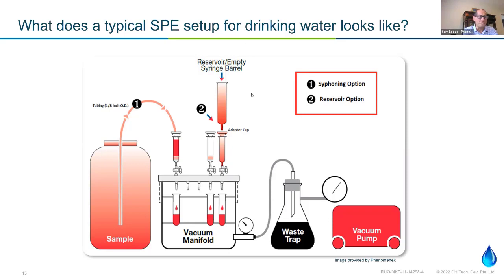One important consideration is these SPE manifolds are sources of contamination. Carl's going to touch more upon this later. EPA 1633 actually requires a sodium hydroxide wash of every component of the SPE manifold, including those that are not in the flow path. And I know that there are some commercial laboratories that have actually taken steps to make the stopcocks and the needles going through the manifold to be completely consumable. So they throw them away after every single extraction to prevent any contamination from the previous extractions.